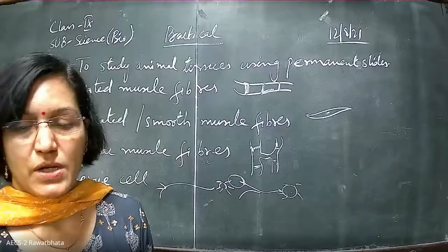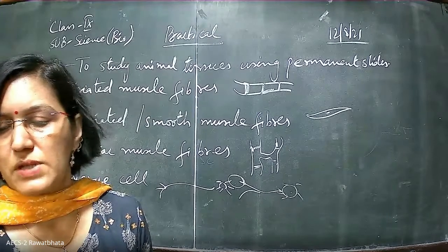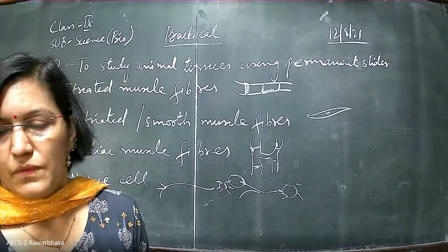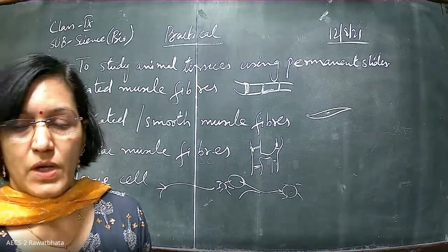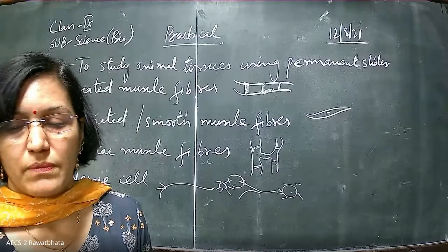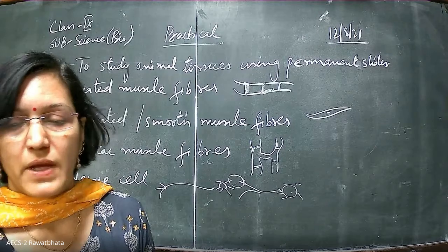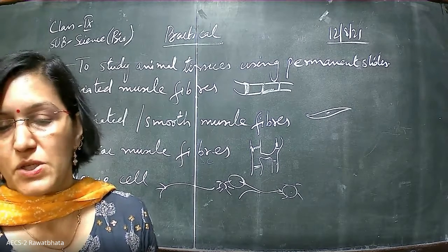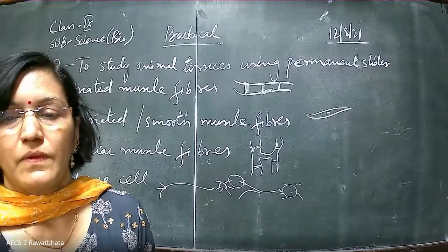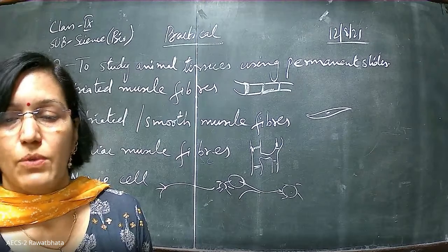And now I'll be sharing with you nerve cells, some of the beautiful slides I have got. And this is how actually the nerve cell should appear to us. Nerve cell highly magnified. This magnification is not possible with the compound microscope, but I wanted you to have a look at this picture. And let's have a look at this one.